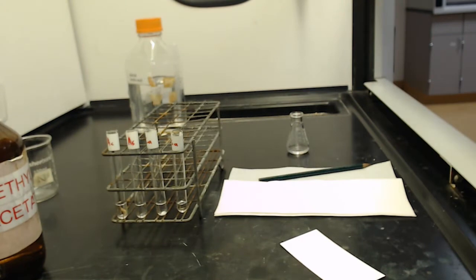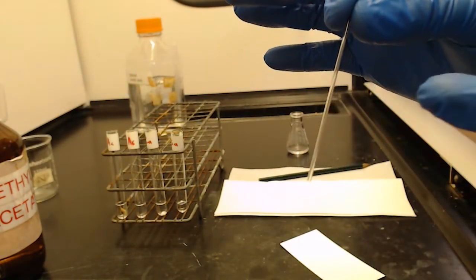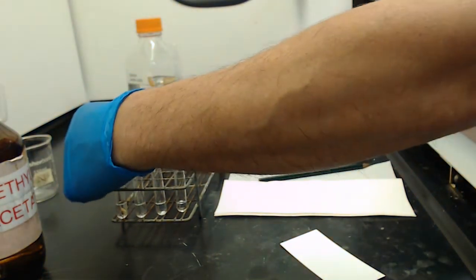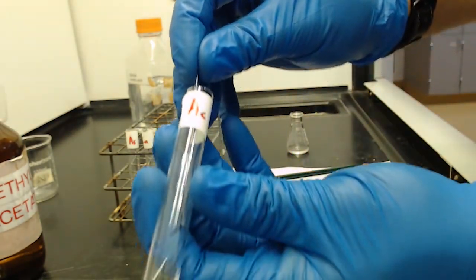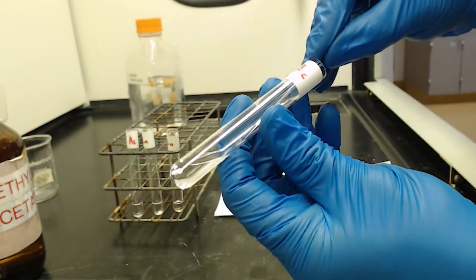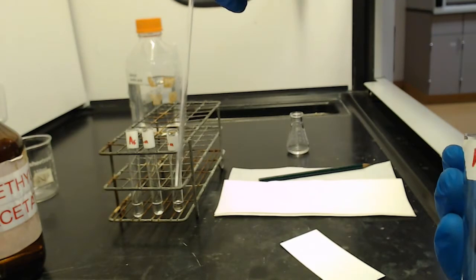To sample our plate, I recommend that you practice on a paper towel first. What you're going to do is touch it into the sample. Some of the liquid will pull up by capillary action, and then you touch it to where you want to spot. So try to get a good view of this. It doesn't reach quite down enough, so what we can do is just angle it a little bit to get it up in there. You just need to touch the liquid, and you can probably see that we have a little bit in the capillary tube now.